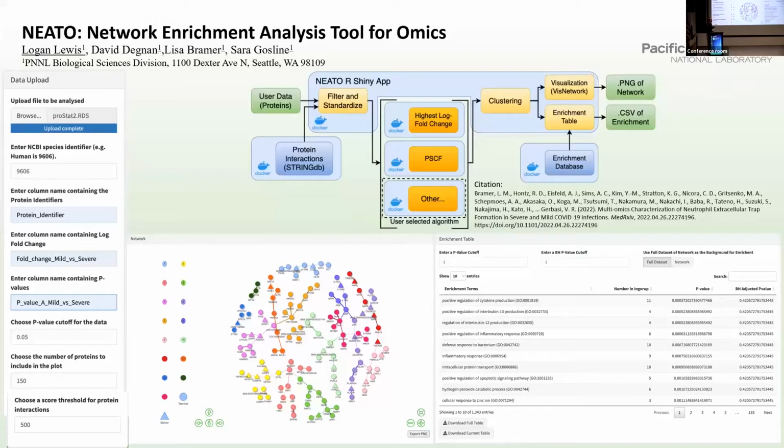So this is going on the MAP framework that Rachel had talked about earlier. Basically, currently in MAP, there's PMART, which does a great job at performing differential abundance analysis. But even after doing differential abundance, there can still be a lot of data and a lot of questions about how the system is actually changing.